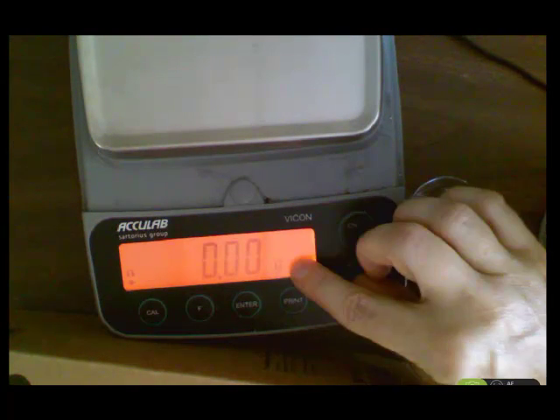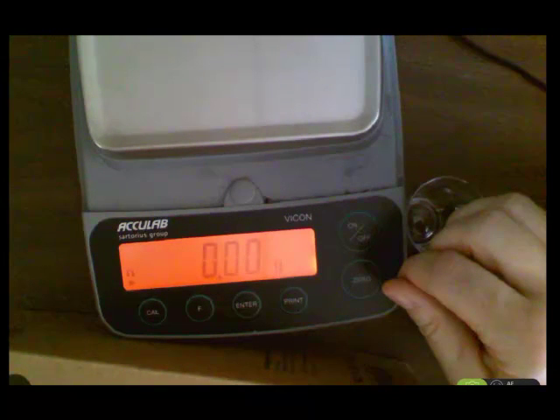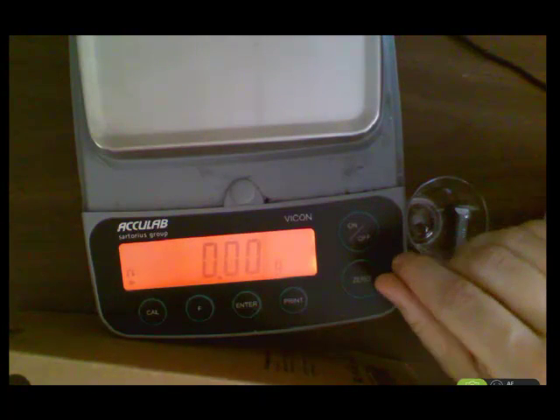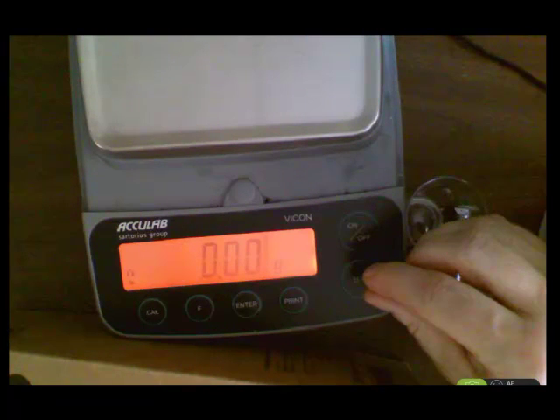If this doesn't say grams, if it says some other unit, call your teacher, because we have to change the measurement units. These balances can measure ounces and all kinds of things. So you should have a G there, and you know you're ready to go.